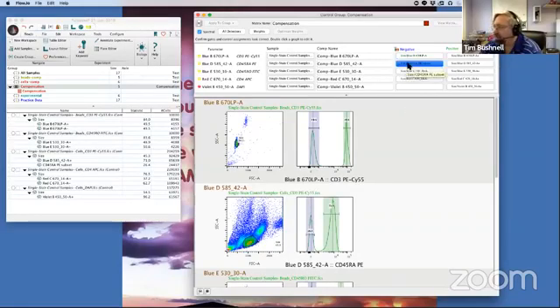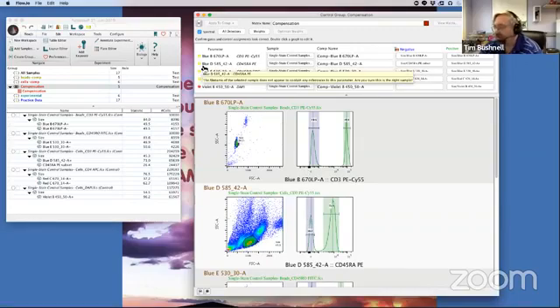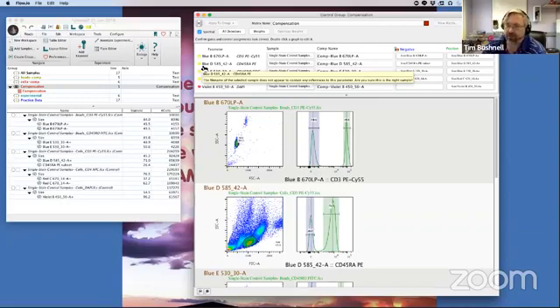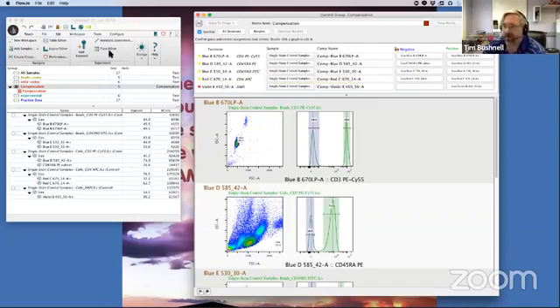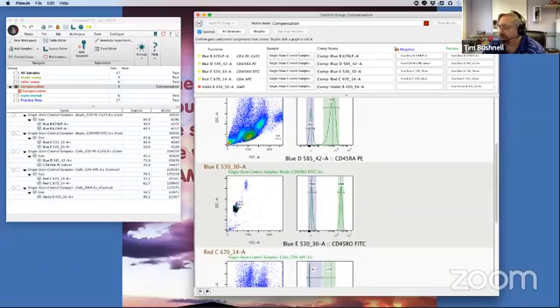You'll see when I double-clicked over here, it opened up the window. And now with the histogram, it gave me the positive and negative. Let's just try and delete this. And we'll try again to see if it prefers. So again, if we come up here, it should be, it is not, for whatever reason, there we go. Now it's finally done. I'm not sure why it took three times, but third time's a charm. So now you'll see it's labeled properly. We have our positive and negative. Our red has gone to yellow. So now basically the yellow is just saying, is this the right sample? Yes, it's the right sample. We're pretty confident on that.